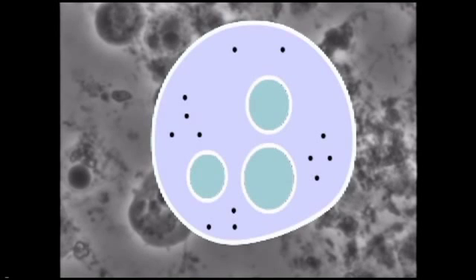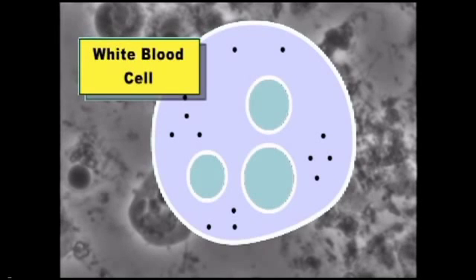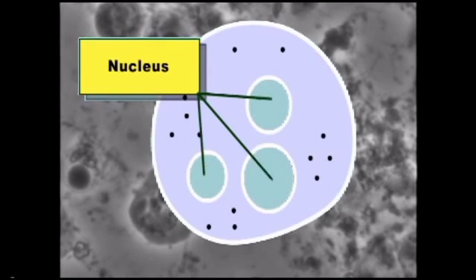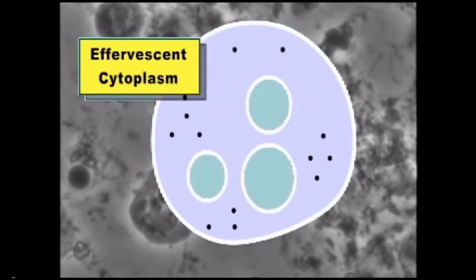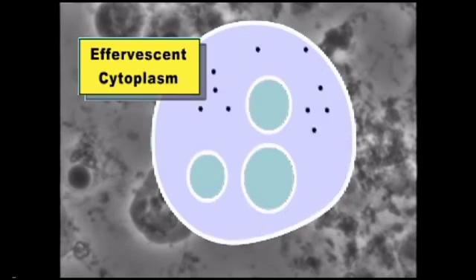This is an animation of what you're about to see in this patient's bacterial smear. This is a white blood cell, your body's defense system. It's a neutrophil with a multi-segmented nucleus. The cytoplasm of the white blood cell appears to effervesce or boil. That characteristic distinguishes the white blood cell from the really bad actors: amoebas in this smear.